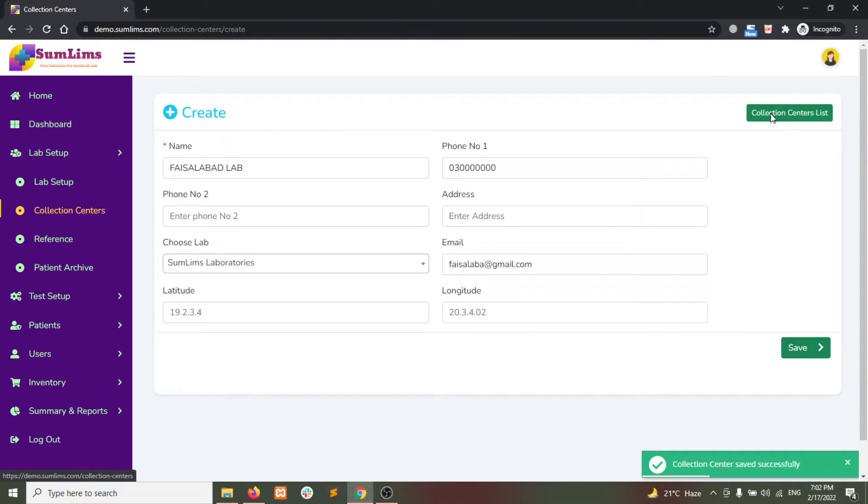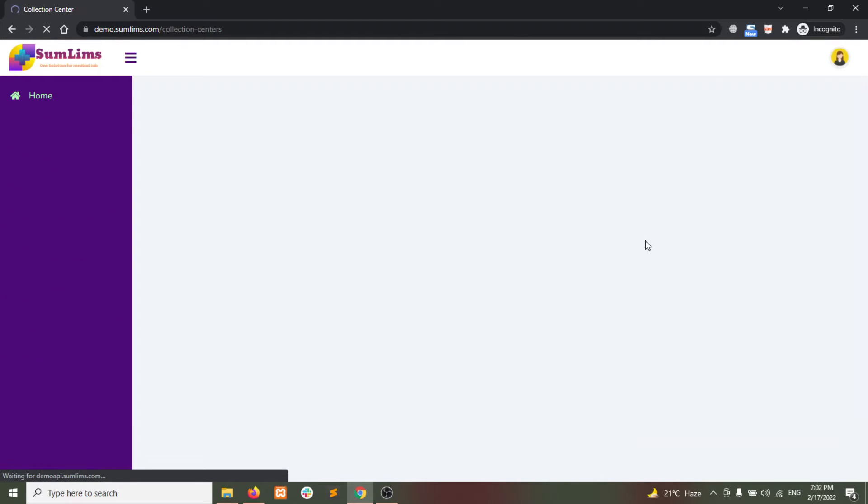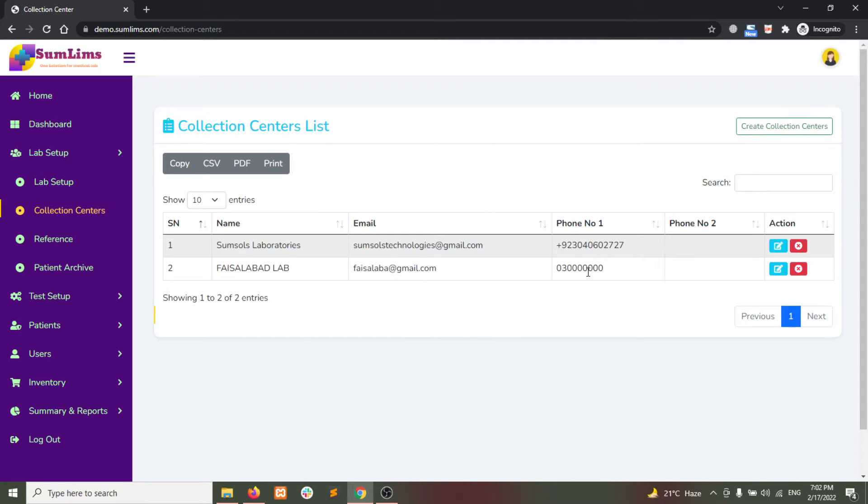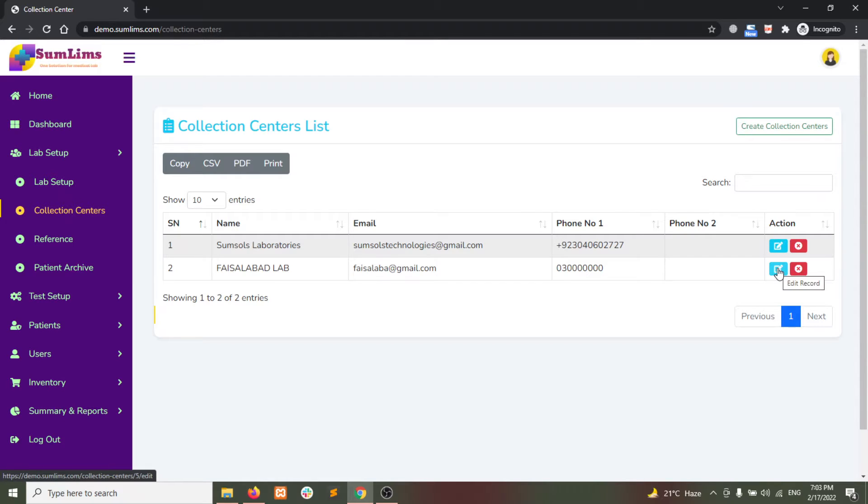You can view the collection centers from the collection center list button. Then you have the choice to edit or delete the collection centers. Let's edit the collection center.